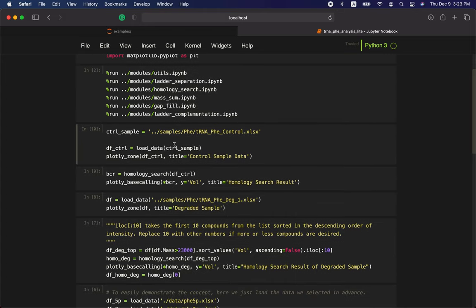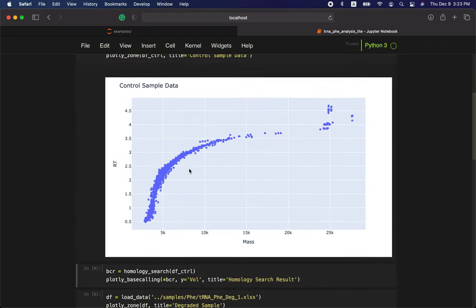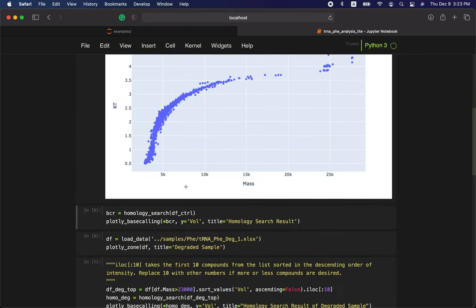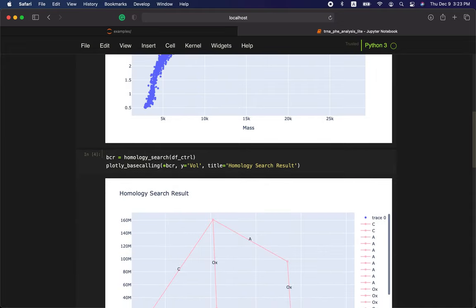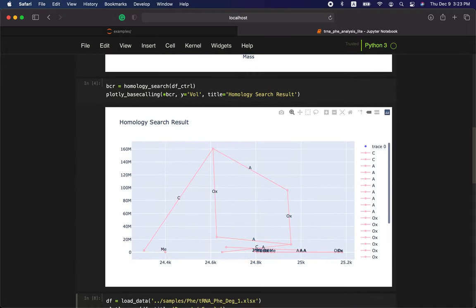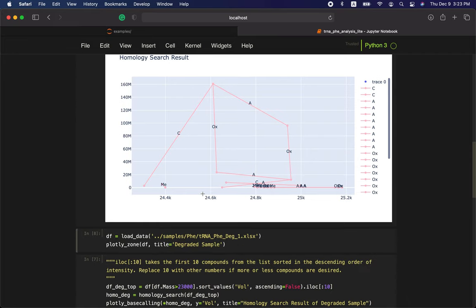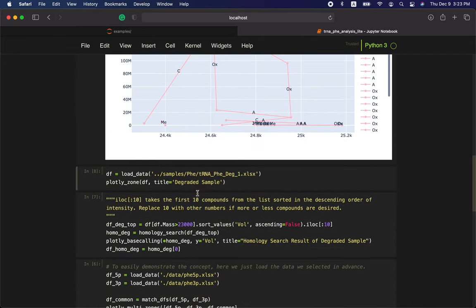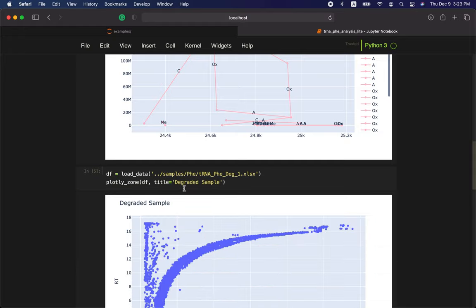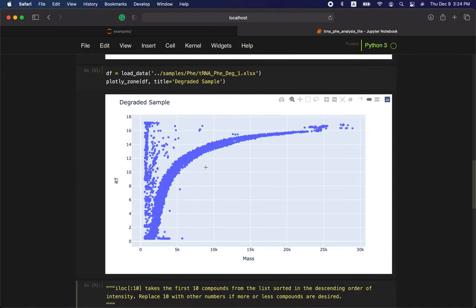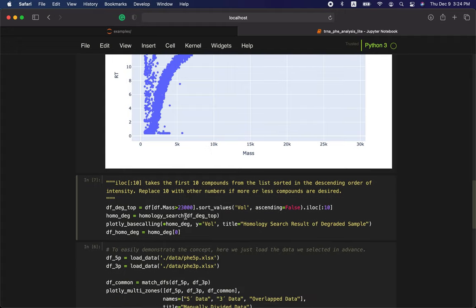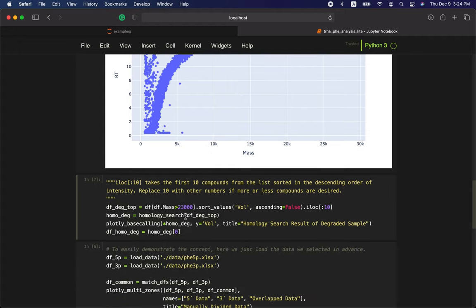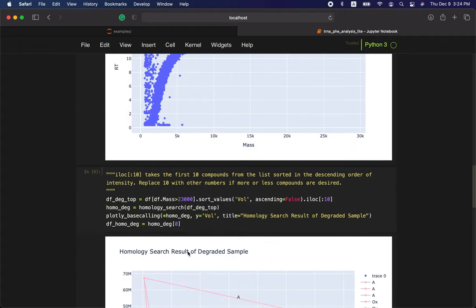We load the control sample and then do homology search on this control sample. After that we load the degraded sample like this.